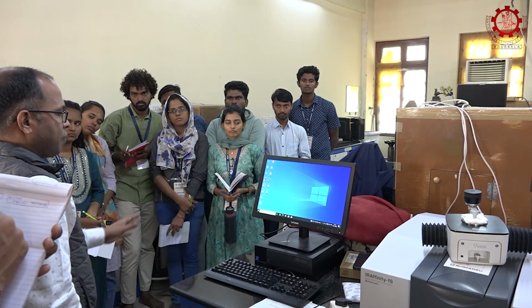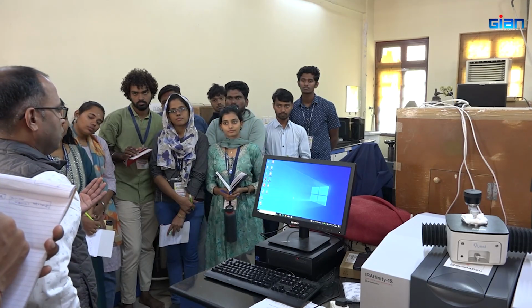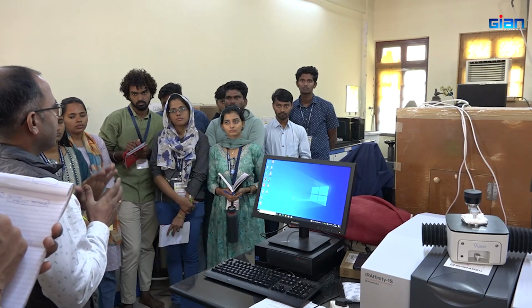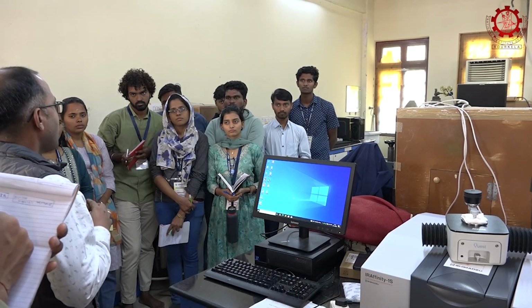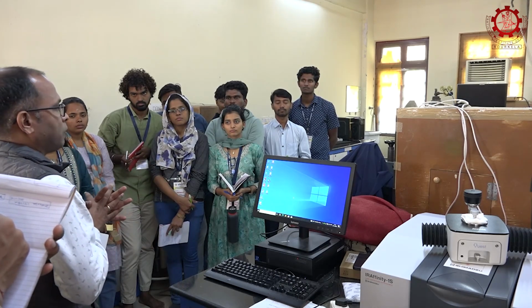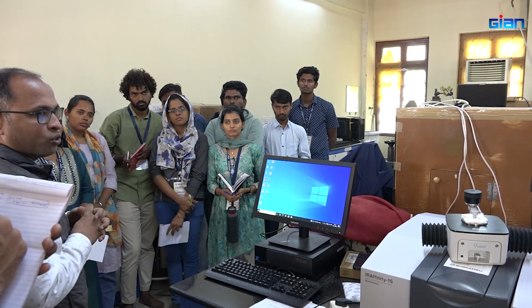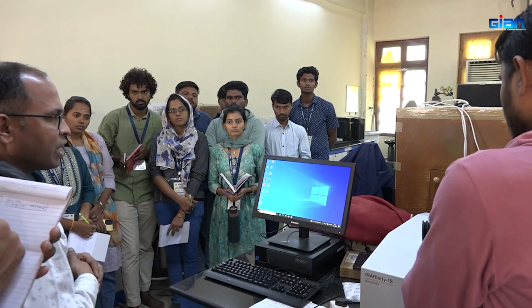After all this operation, when you see how you are getting the spectrum for your sample, then if we have time, we will go to our seminar room and I will explain how we analyze the spectrum to get the information we need. So now Subhadip, can you please help us in explaining this?